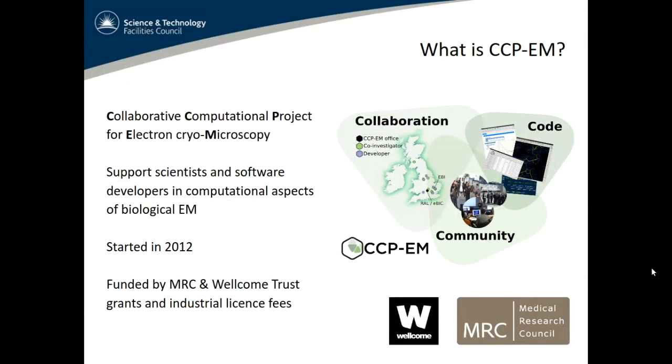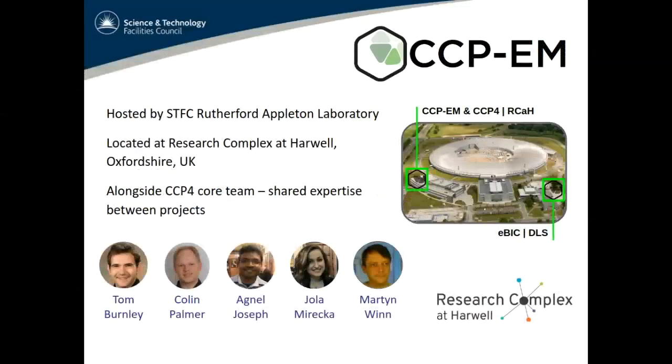So just to explain what it is briefly, Ccp-Em stands for the Collaborative Computational Project for Electron Cryomicroscopy. There are a number of these CCPs in the UK. We're one of the younger ones, but we work quite closely with CCP-4, which is for the X-ray crystallography of proteins, and so I'll mention those as we go through. The role is to support scientists and software developers in computational aspects of biological cryo-EM. We've been going since 2012 and are funded by the MRC and the Wellcome Trust.